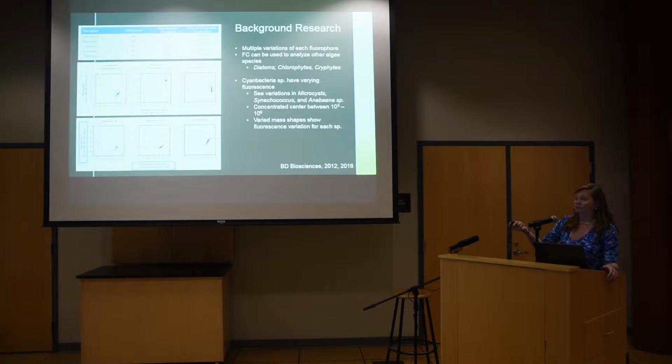So these are density graphs, and you'll see my particular density graphs later, but this is just showing you where that species of cyanobacteria is fluorescing on your graph from your machine. The machine is feeding all of that information to the computer model, and the computer model gives you this as it is being processed. The density shows you the highest density of points of the cell.